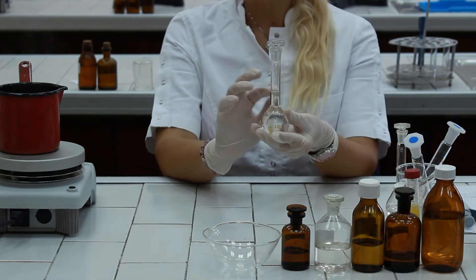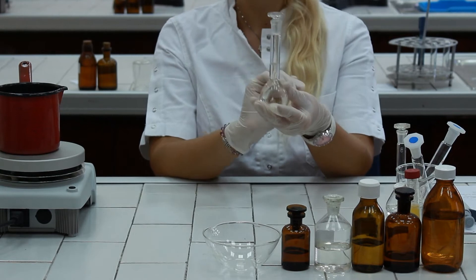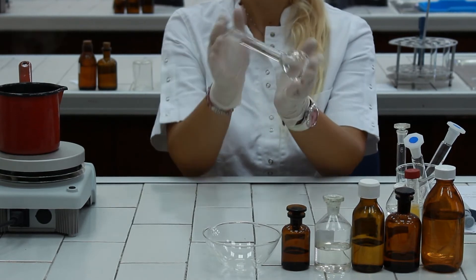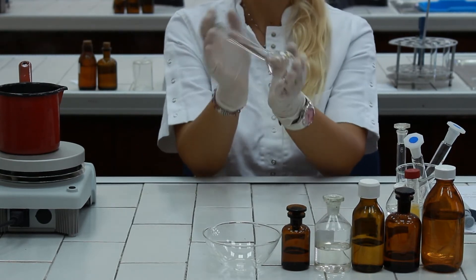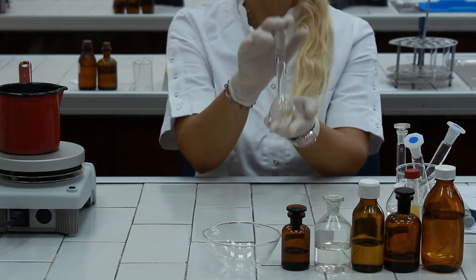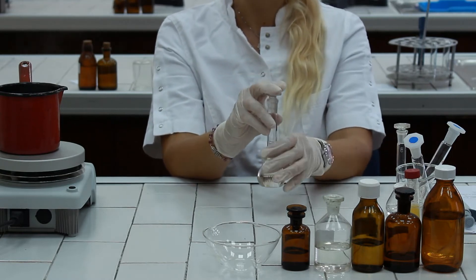When we adjusted the level of the liquid at the graduation mark, mix the volumetric flask few times upside down in order to homogenate the mixture.